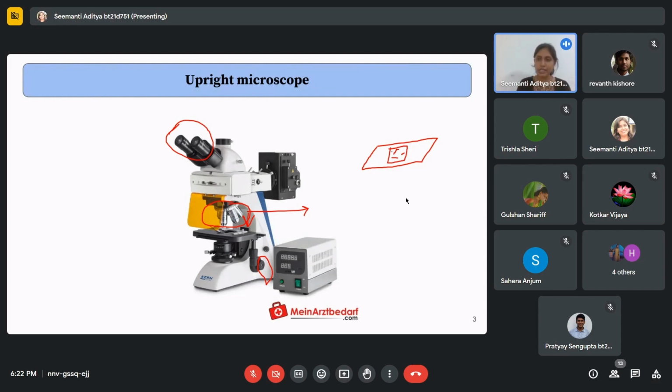So that is this kind of imaging. But if you have a live fish, or an insect like Drosophila, those kinds of animals are placed in some soft agar media, just so that the animals don't move.